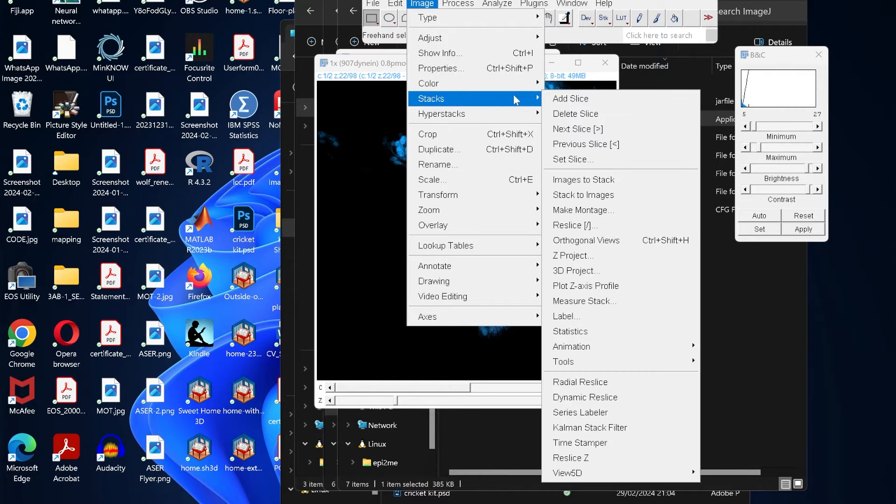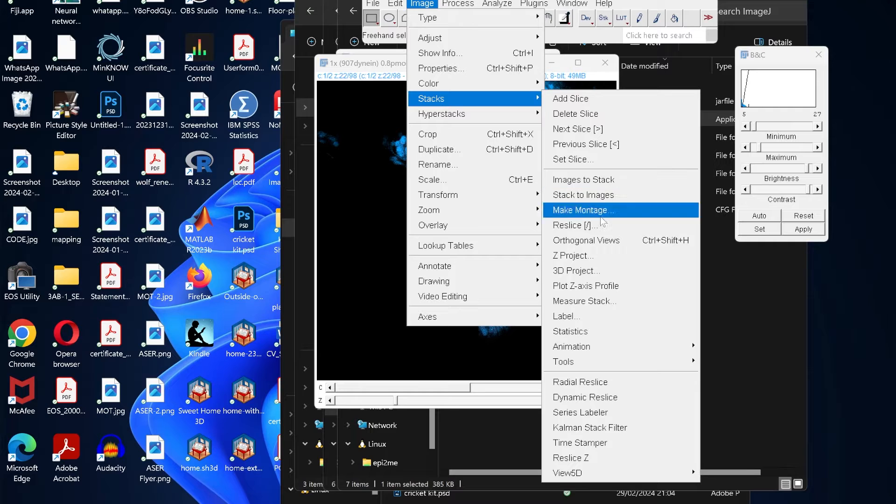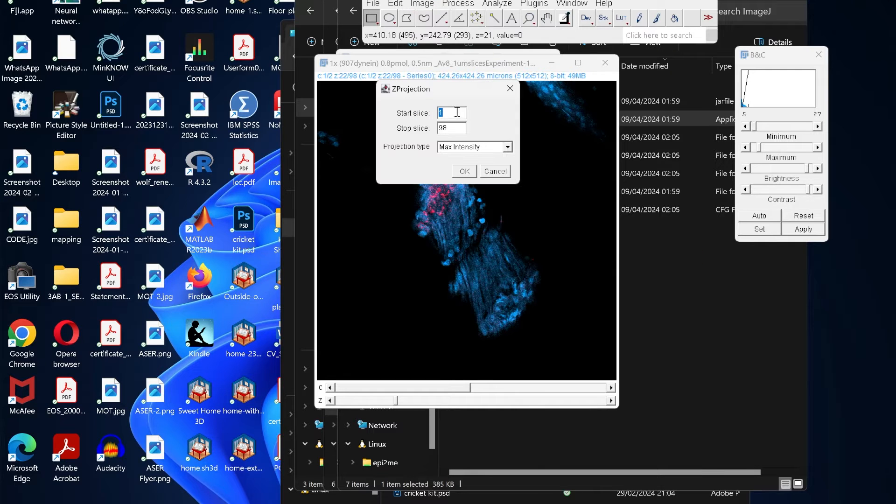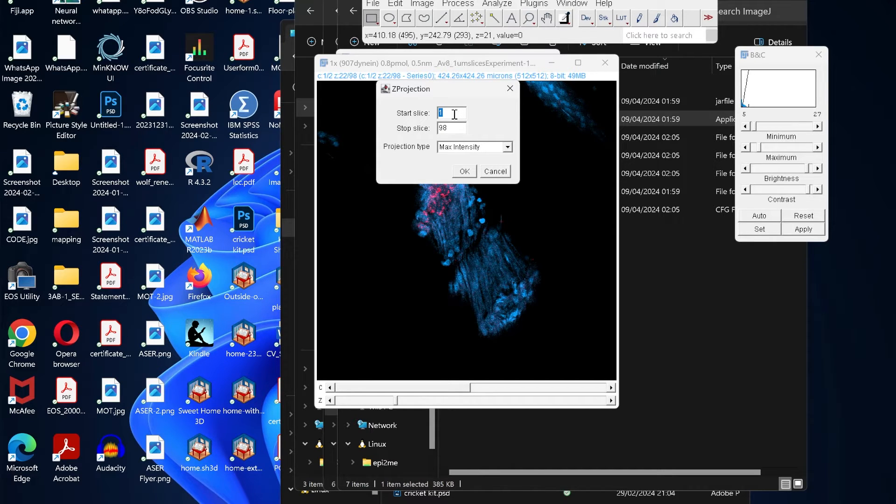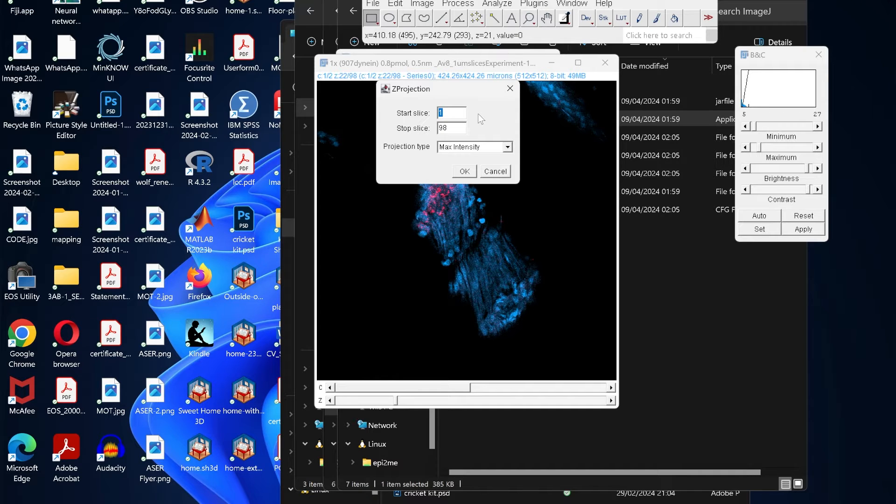Then click on Stacks and then click on Z Project. Here it's asking about the start slice and the top slice. We have a total of 98 slices. If you want to get rid of some of the slices, maybe at the start or maybe at the end which are not good enough, you can get rid of that.